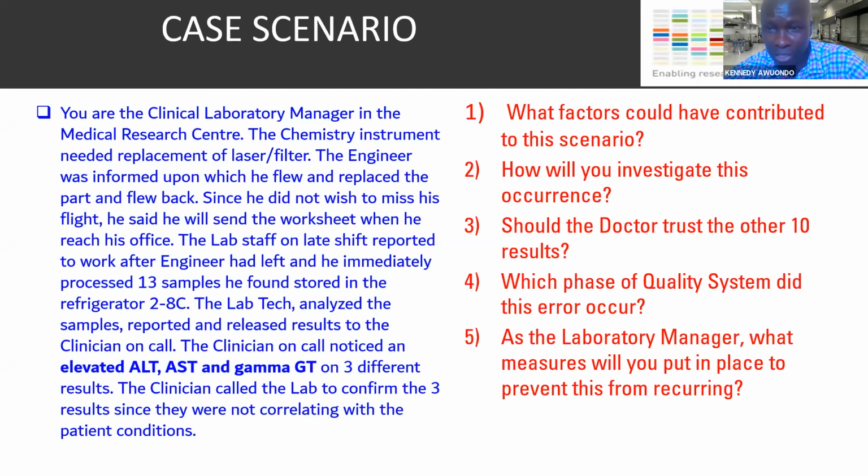Any other before we move to 3? There's one from Kayode Adiemi. Investigation of the occurrence could be by checking lab records of the technician that reported the results to the clinicians. See if there are variations in testing criteria from the normal standards set by the manufacturers. So that's from Kayode Adiemi. Okay, lab record of the technician who performed the test. Yes, these are all good inputs coming in. And since many people have got systems in place, let's move to question number 3.